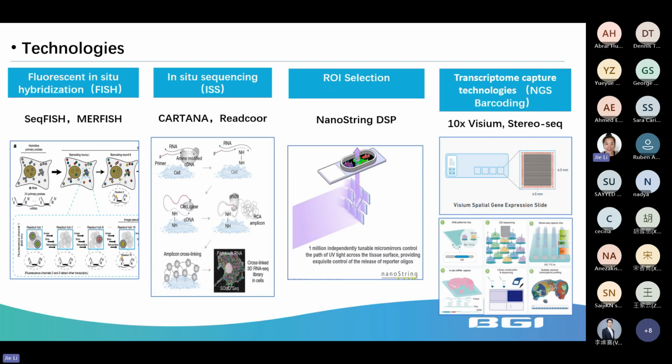So there are actually multiple technologies based on spatial omics on the market, but the core objective of spatial transcriptome is to link gene expression data with its spatial location within the tissue. Spatial transcriptome is not a technology that came out overnight. It has actually accumulated decades of scientific progress. Initially, scientists relied on the microscope to observe the structure of cells and tissues.